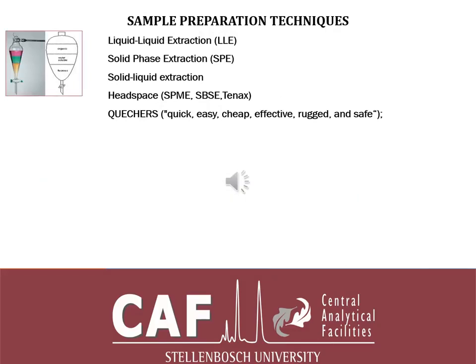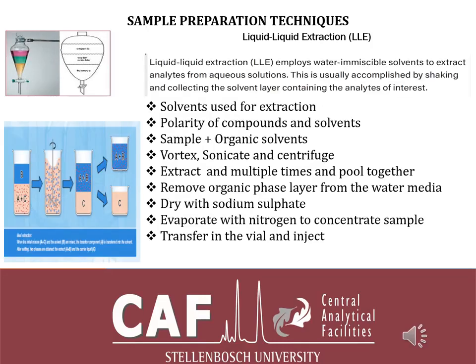As mentioned earlier about sample prep techniques, we'll have a look at liquid extraction, solid phase extraction, solid liquid extraction, headspace, and QuEChERS, how they are used and where they are used. Now let's continue with the sample prep. First, we're going to talk about liquid extraction.